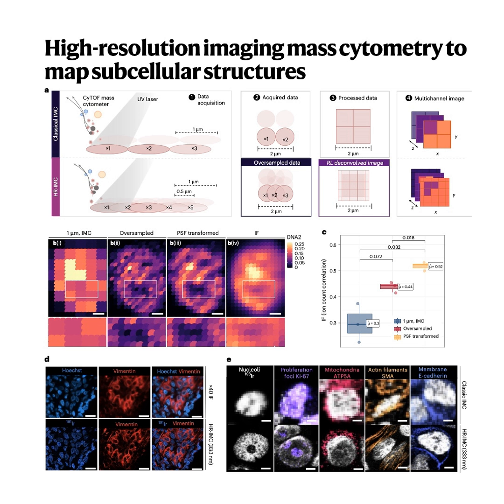This custom PSF had to incorporate those 2 unique factors we just talked about. First, the geometrical overlap. They calculated the proportional area covered by each bordering subpixel using intersecting circle geometry. And second, they incorporated that inverse sigmoidal model of the expected signal remaining, given how many destructive laser passes that subpixel had already seen. That is just brilliant. It's so complex. They accounted for both the geometry of the overlap and the material destruction rate. And by mathematically crunching that custom function over and over for every overlapping shot, they transform these low-resolution measurements into crisp, high-resolution data.